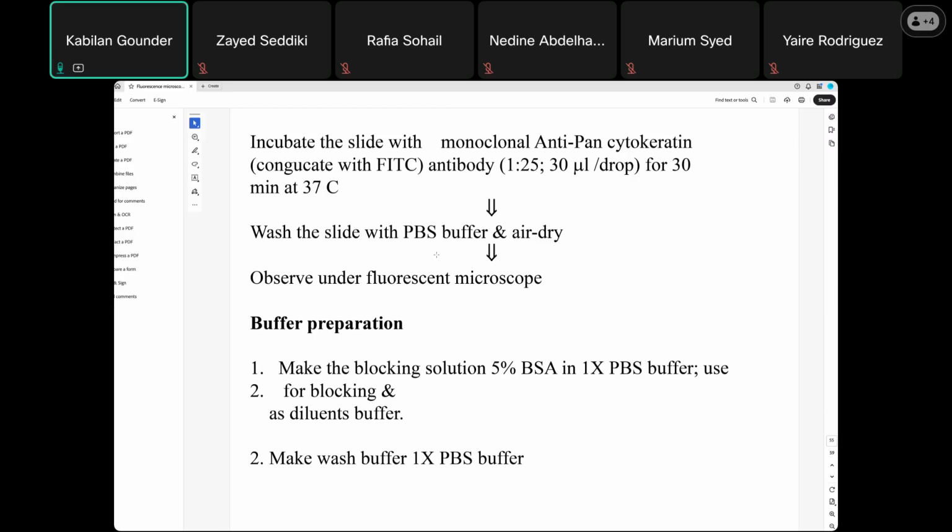You are not taking a cross section or any different sectioning steps; this is direct, you just want to see the buccal epithelial cells. Don't confuse it with the typical process if you really want to do cross sections, which is a different technique.